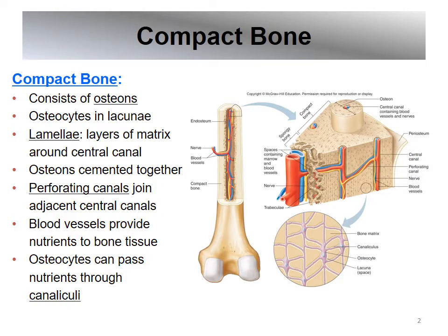So in the previous video, we talked about how the long bone had a hardened middle shaft called a diaphysis and expanded ends called epiphysis. And so this right here, this bone's been cut, and you can kind of see, we talked about the articular cartilage on this. This is the bottom end, the distal end of a femur. And so what we've done here is we've cut the diaphysis in half, so you can see the inside of it. We talked about it a little bit on the slide or the video previously.